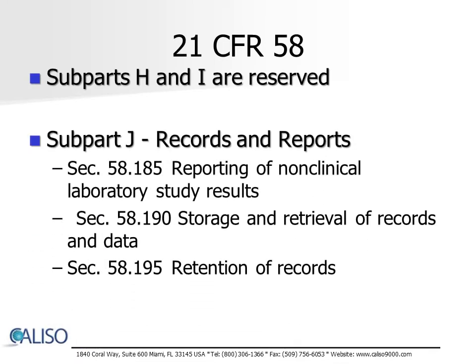Subpart J, Records and Reports. Reporting of non-clinical laboratory study results. A final report shall be prepared. Storage and retrieval of records and data. Storage shall allow expedient retrieval of all data. And finally, retention of records. Records must be stored for at least 2 years following the date on which an application for research or marketing permit, but this requirement does not supersede record retention requirements of any other regulation.